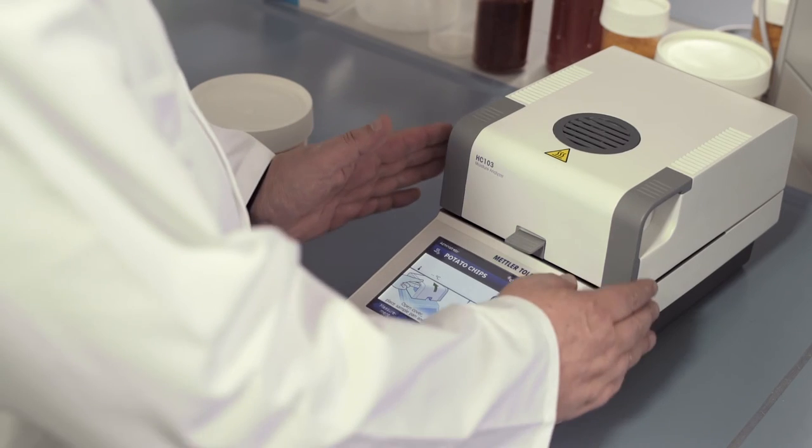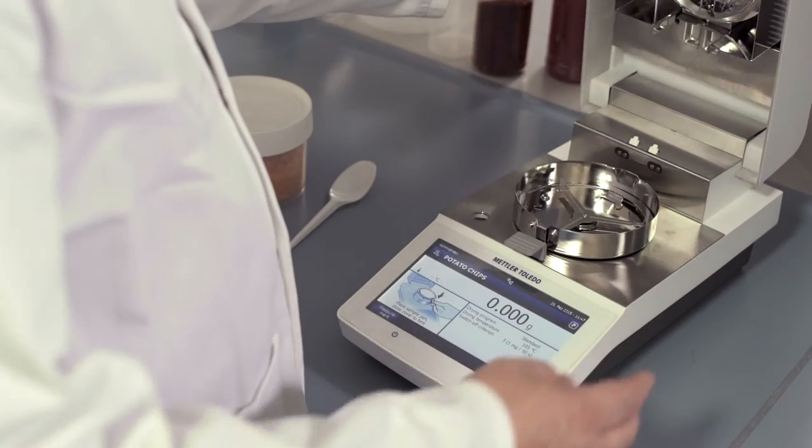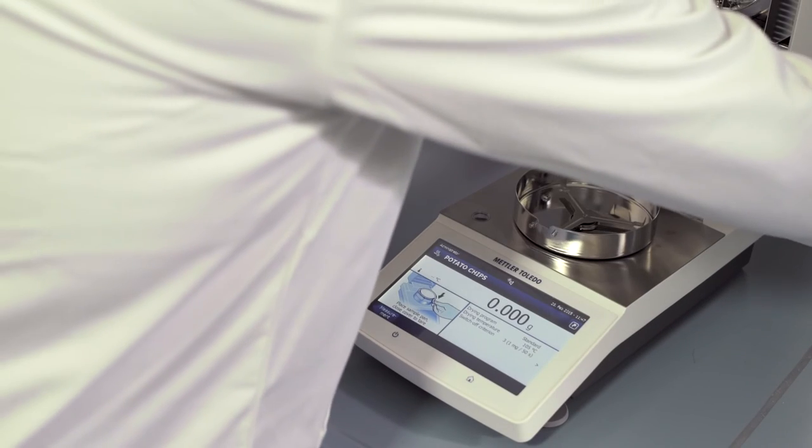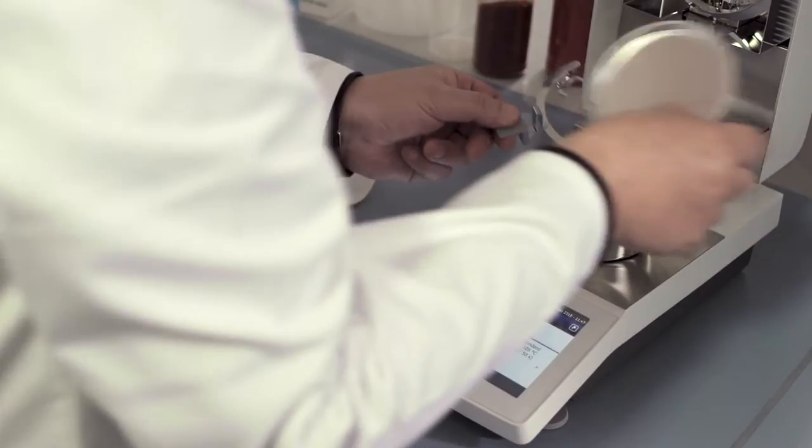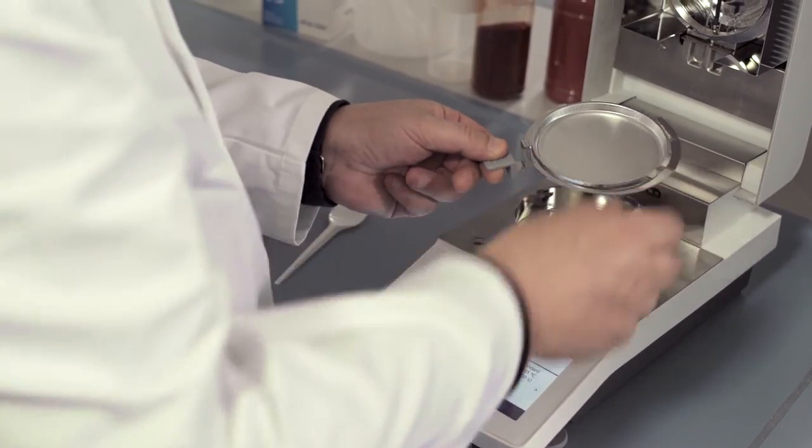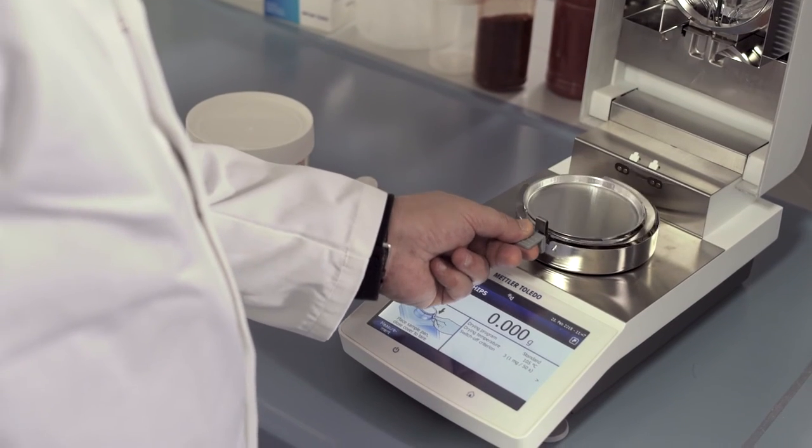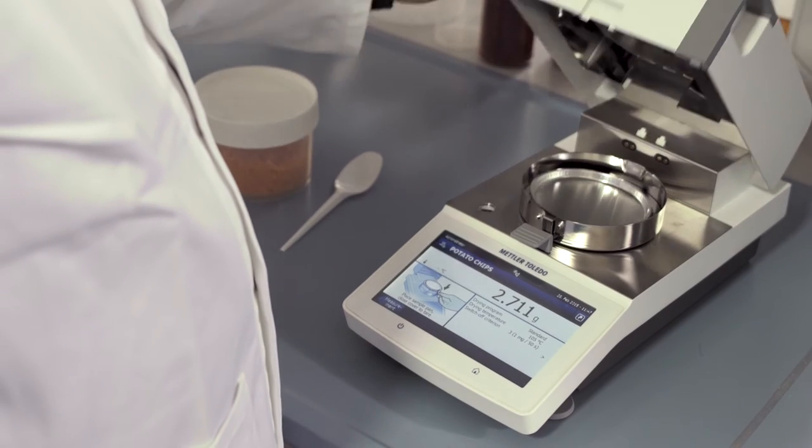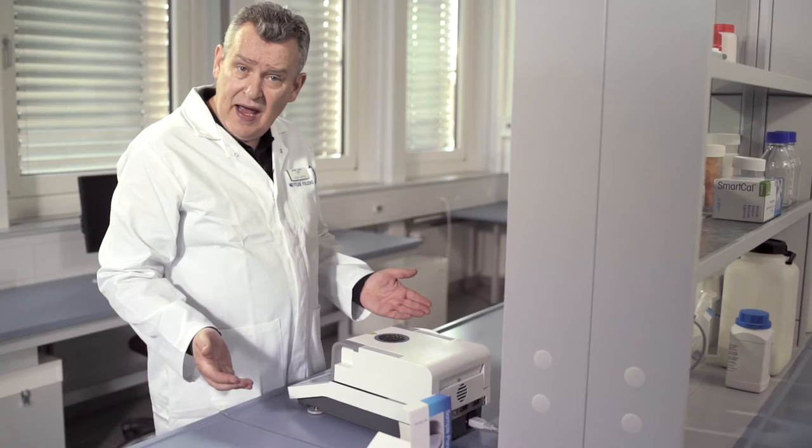Place the aluminium sample pan in the pan handler. Place the pan handler on the weighing pan and close the lid to automatically tare.